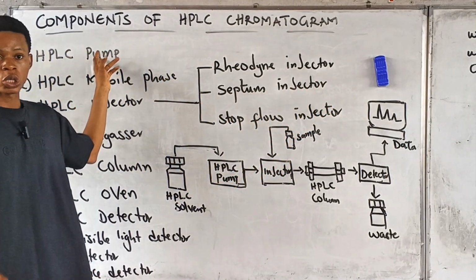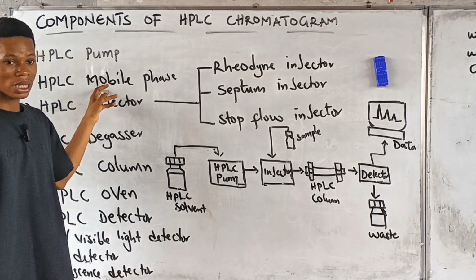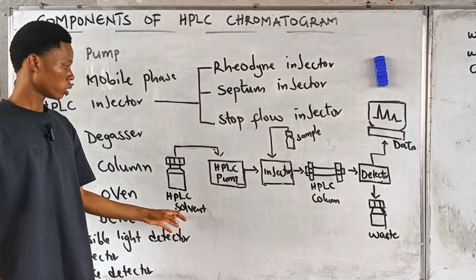If you forget what I've said so far, don't forget that. HPLC pump provides the what? The pressure needed, right? Mobile phase carries the what? Analytes. Is it not? So the mobile phase is the solvent we are using here.